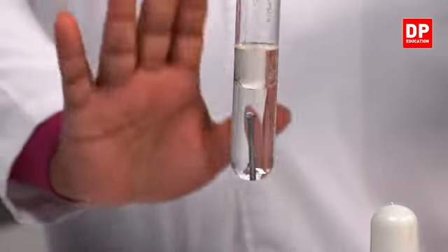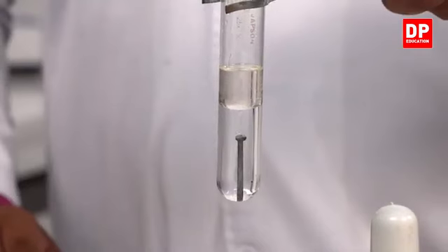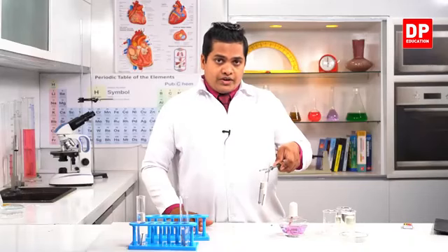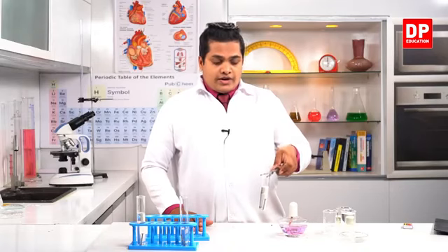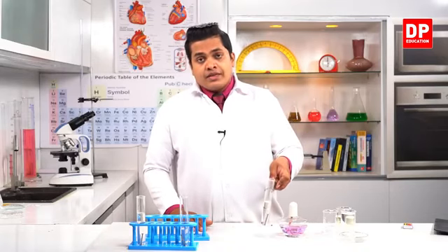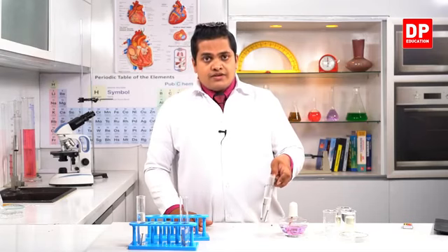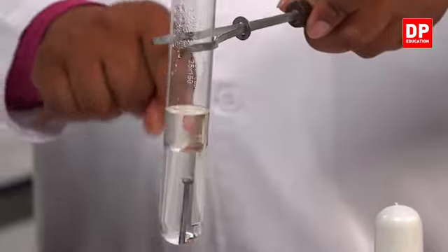But this one, it's also been exposed to the normal atmosphere. But when you're adding coconut oil into it, the gases which are in the atmosphere are not getting in contact with the water at the bottom.